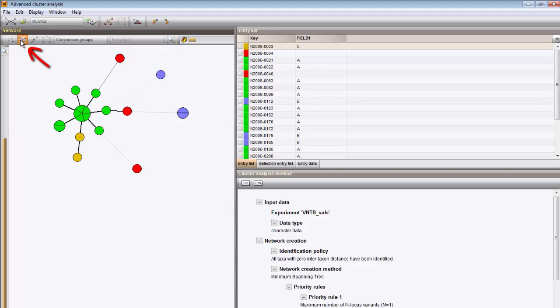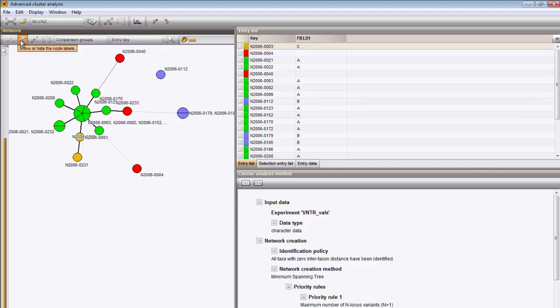This button will do the same. The branch labels can be shown as well, which in this case are the distances.